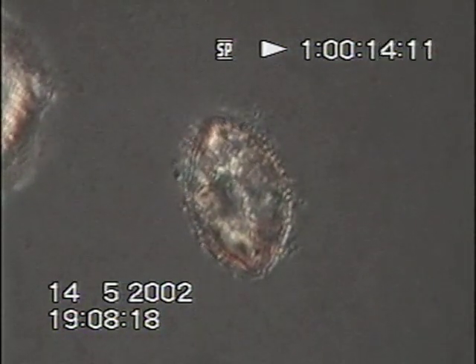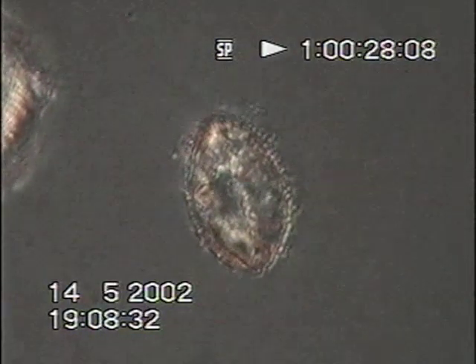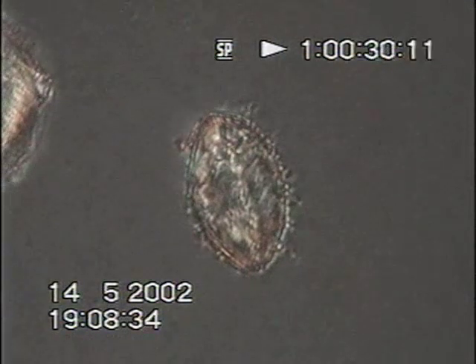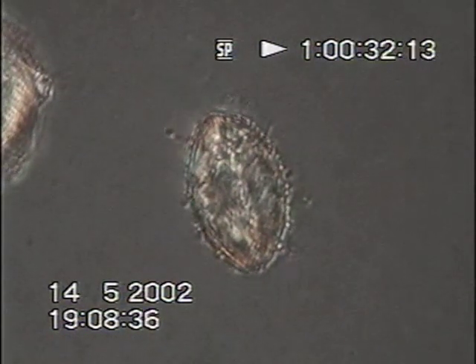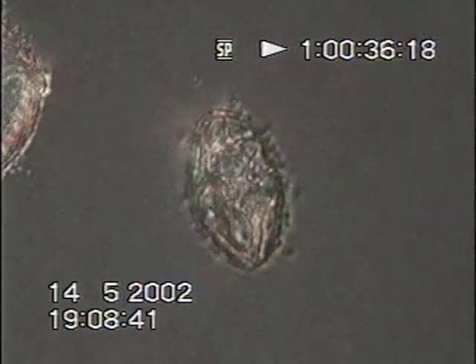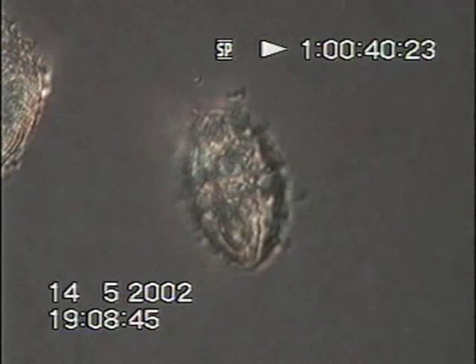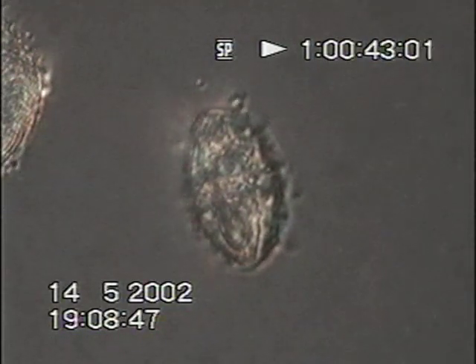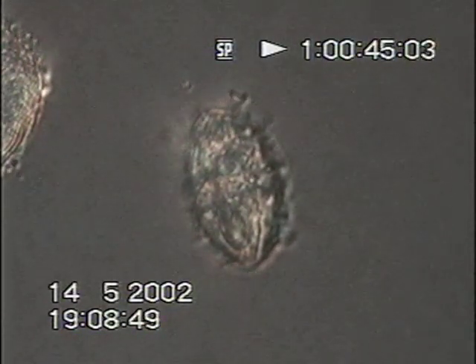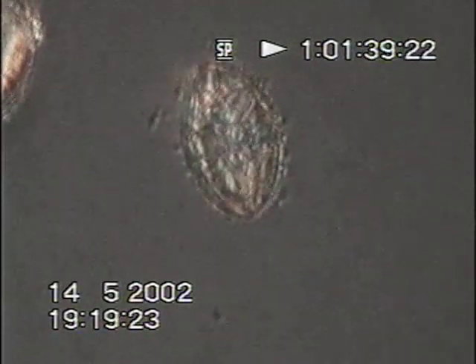This is certainly the best specimen we've come across. And these tendrils or fibrils or fimbriae, whatever they are, I wonder if anybody knows anything about them. Are they peculiar to chestnut pollen? Quite extraordinary.